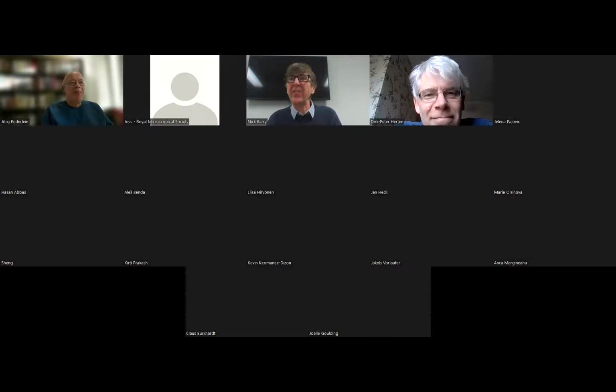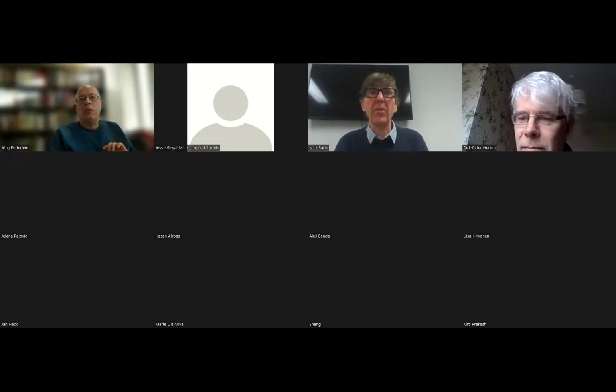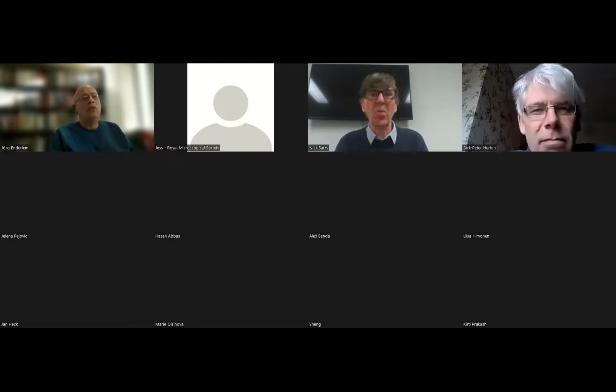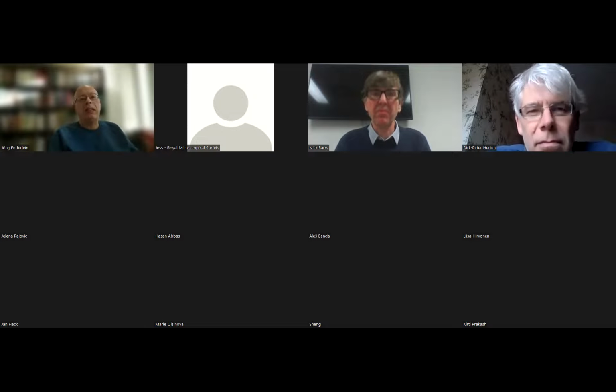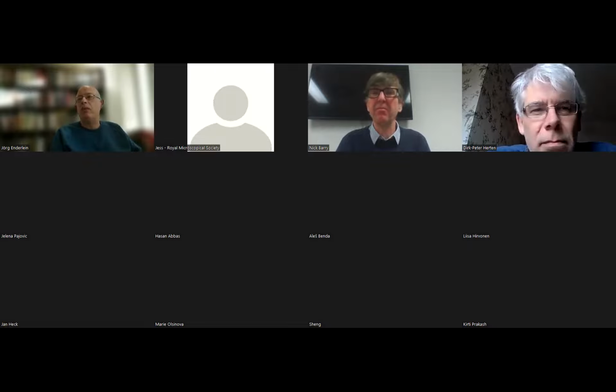I think the second part was how long do you have to measure for a confocal STORM image? For the images I showed you, one example where we look at the chromatin in the nucleus and also at the tubulin network, you can do it with a few images per second. So we are talking about something like 1 to 10 hertz. It really depends on how bright your dyes are and how much excitation intensity you put in. But of course, you cannot go as fast as with wide field.